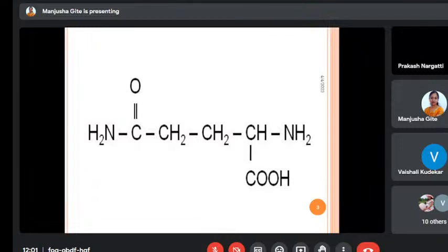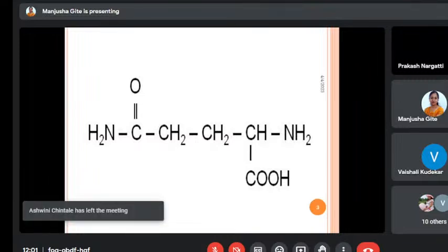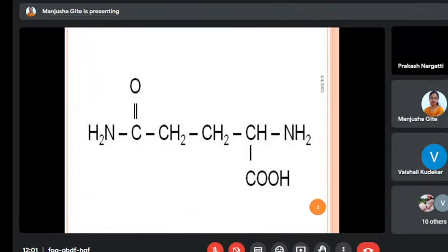While in dimethyl ether, both methyls are equivalent because their environments are the same. Also, their splitting is different. The first CH2 will give a triplet; what will the second CH2 give?